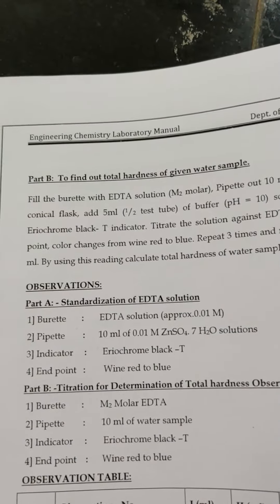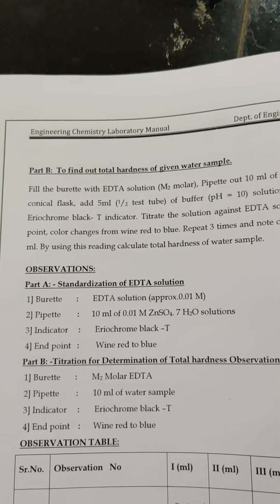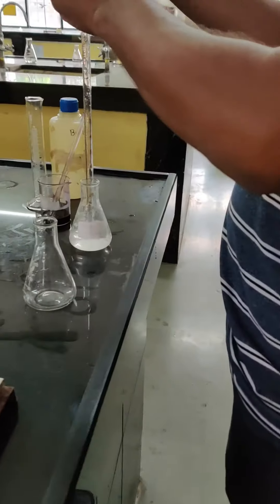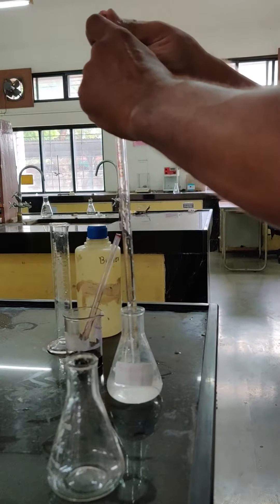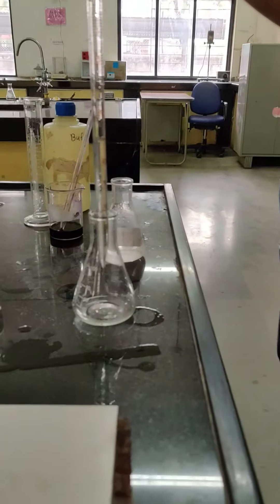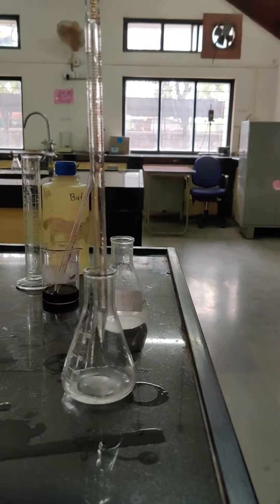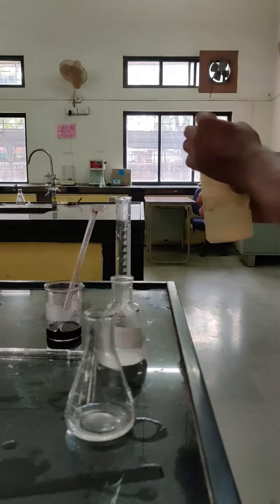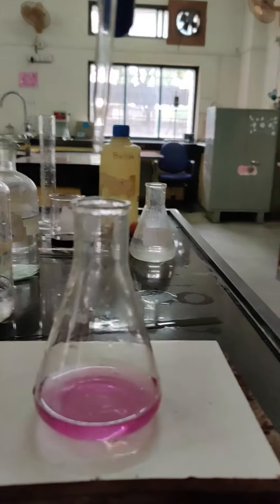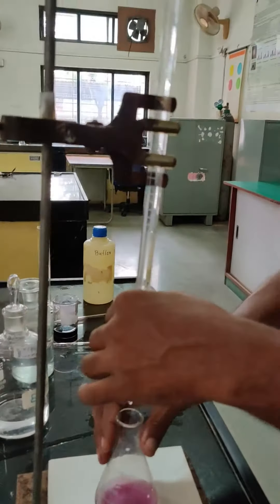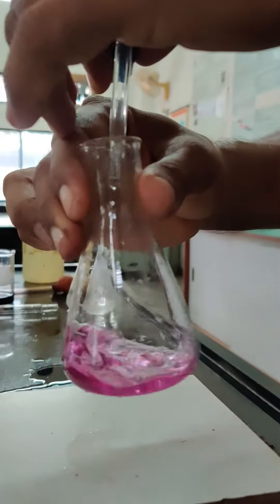Now the second part is the titration to find out the total hardness of the given water sample. We do the same process again: take 10 ml of hard water sample with the help of a pipette into the conical flask, then add 5 ml of buffer solution and a few drops of EBT indicator. On adding EBT indicator, you get a wine red or pink colour. Then we start adding EDTA solution from the burette until the end point, where we get blue colour.